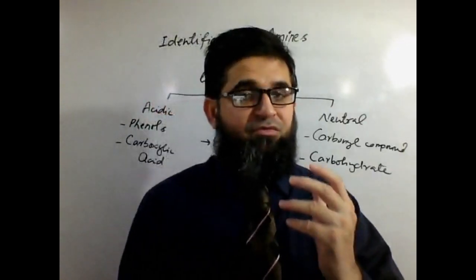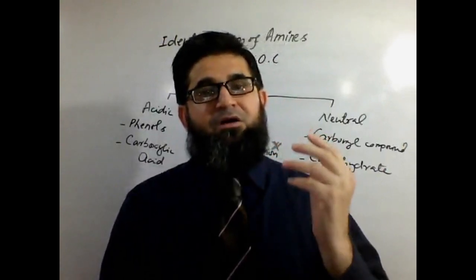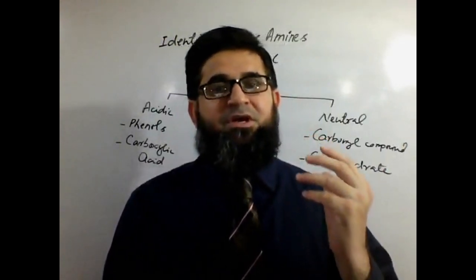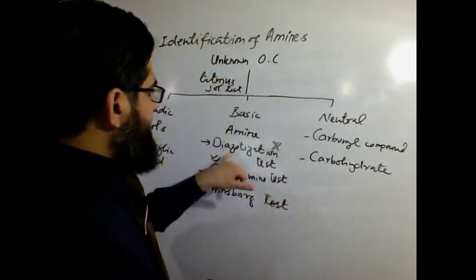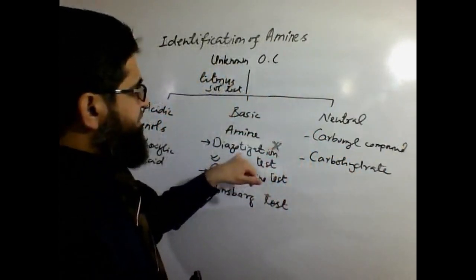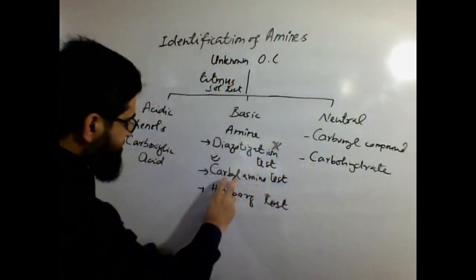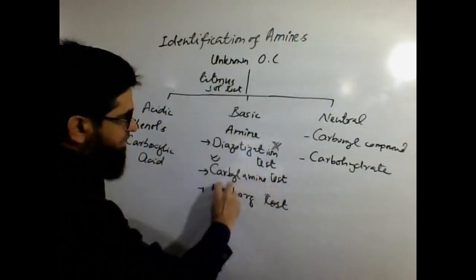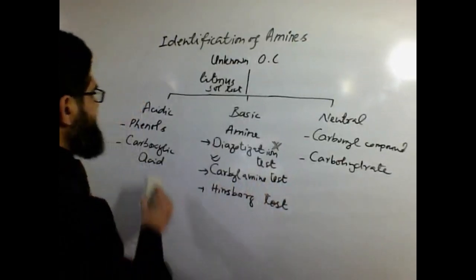So this is how one can confirm the presence of amine by applying the carbylamine test, if you don't have access to the ice or the other reagents involved in the diazotization test. So let me explain the carbylamine test for the identification of amines.